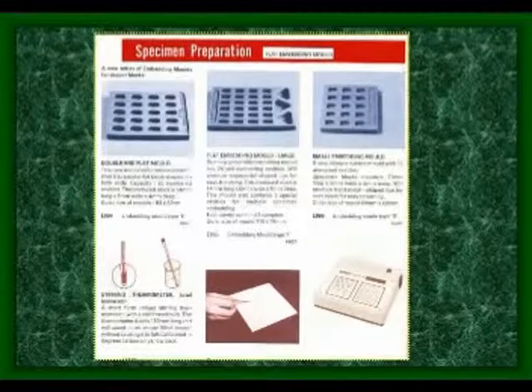What is meant by embedding? Embedding is nothing but the technique in which the tissue is enclosed in a solidified form of the medium. It is known as embedding. This embedding is usually performed by means of a silicon rubber mold, beam capsule or gelatin capsules.